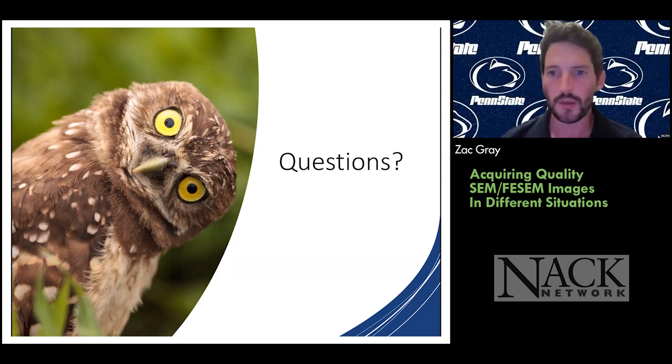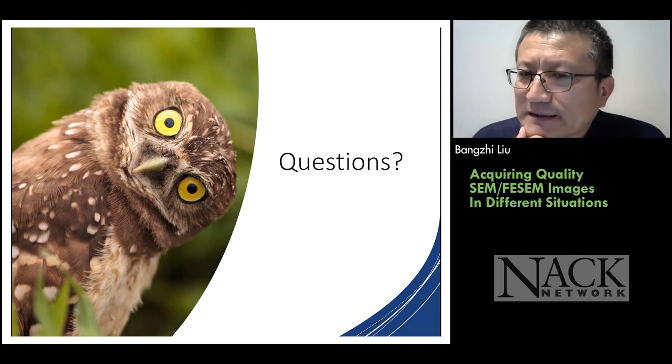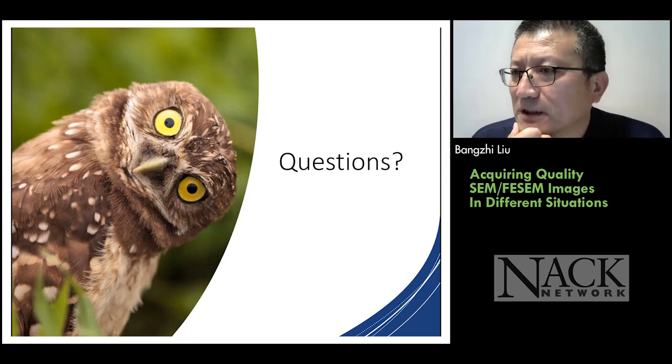Okay. So for samples that aren't good conductors of electricity, you had mentioned charging. Do you have to coat these things with a metal, or are there other options to get good images without charging? Yeah, that's very good. Right now, people are trying to image insulating materials, even biomaterials, they are all insulating. So charging is a big problem.